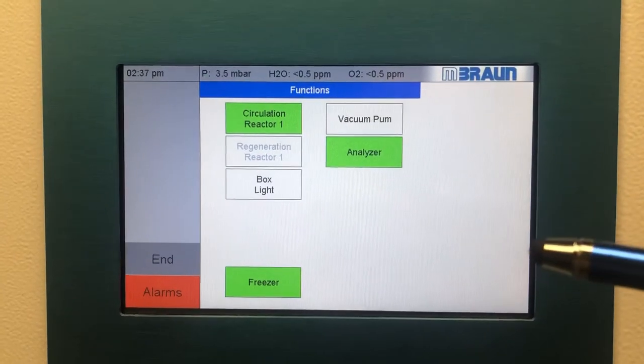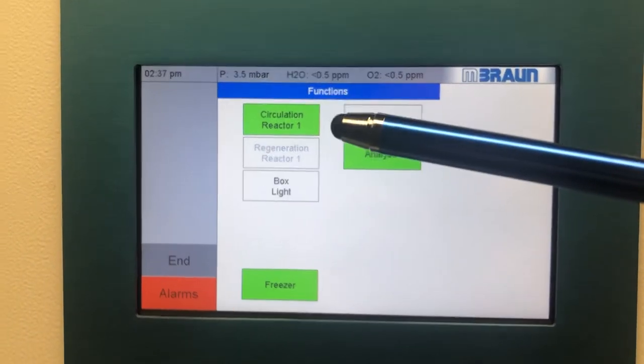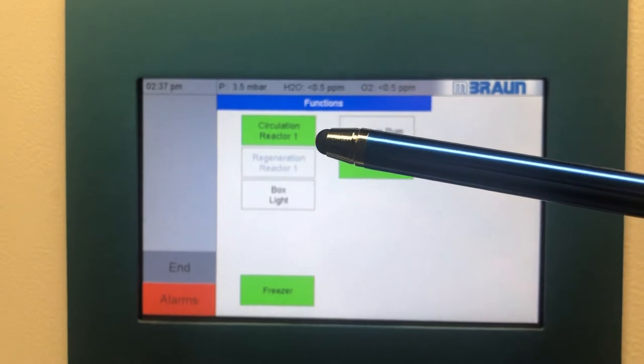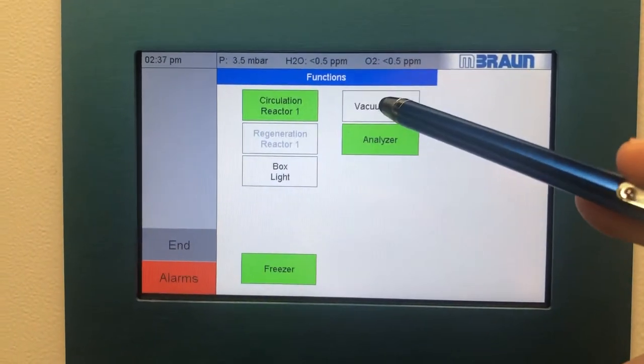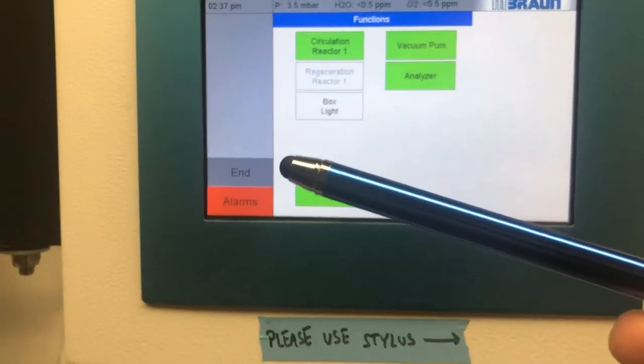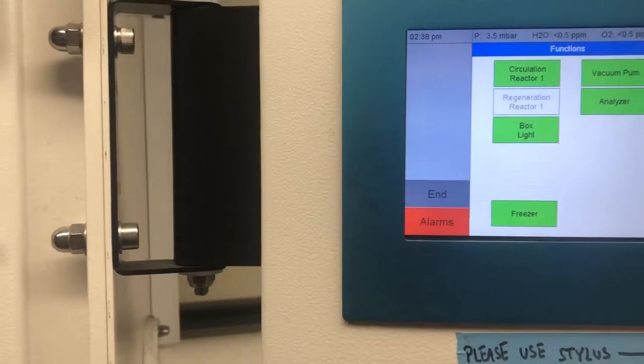Before using the glove box, you will have the circulation on and you want to turn on the vacuum pump. Always use the pen. If you're going to be entering into the chamber, then go ahead and turn on the box light. This illuminates the chamber.